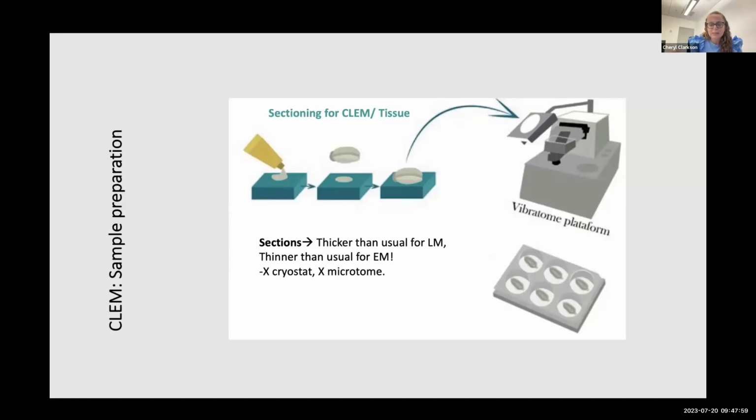But for light microscopy, the immunofluorescence, they don't like such thick sections, and we cannot use CLARITY, we cannot use BABB, because at the end we are going to be using EM. So we compromise a little bit, and we are cutting around 150 microns. And this is very important.